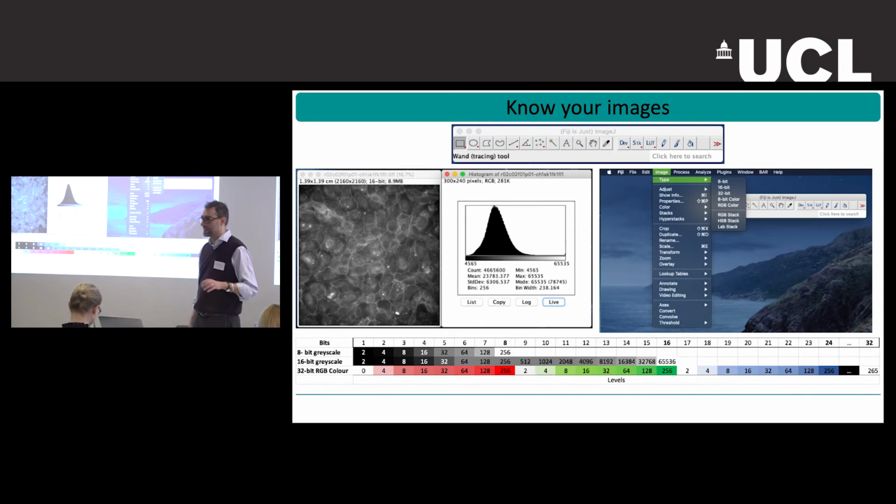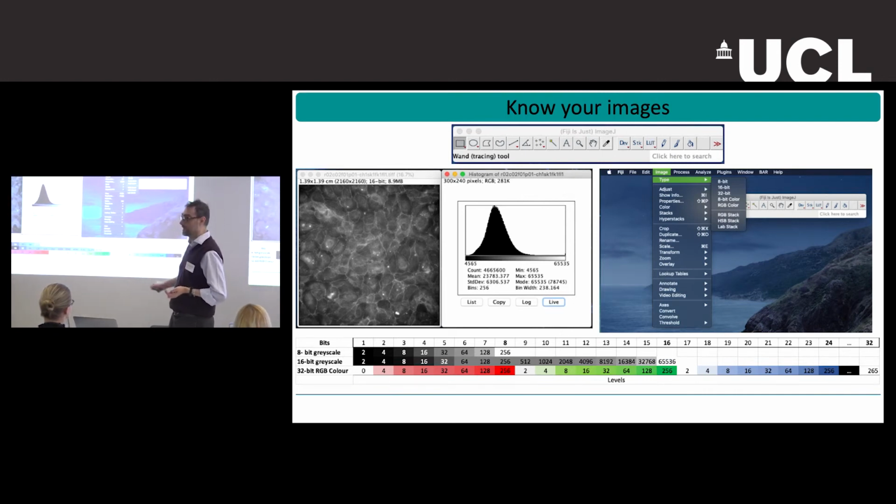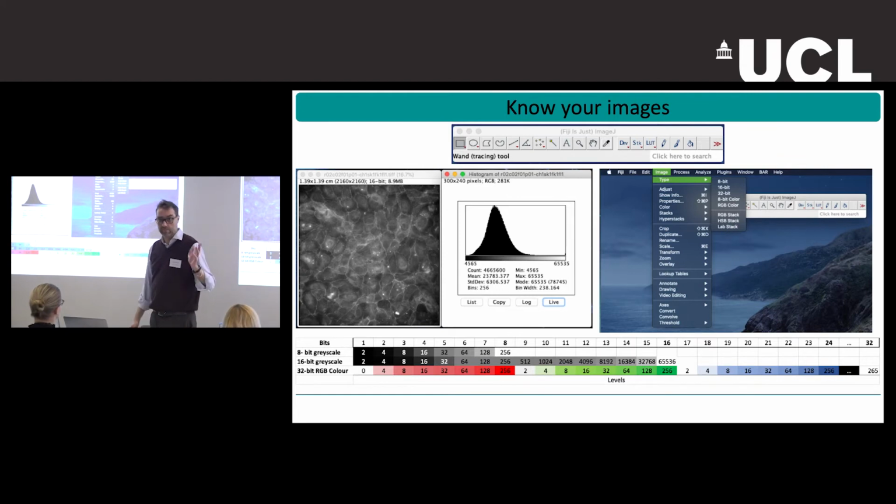So this was an example just to introduce you to what I would like to try to do more interactively with you in the following hour or so. So if you have questions now, for example, about this first slide, who can say, oh, come on, this is super familiar, you are really boring me? What is the histogram of the image?